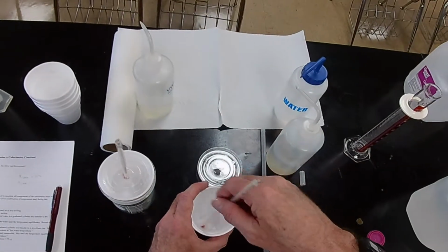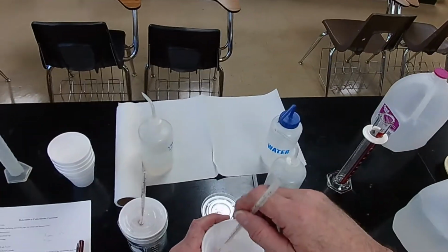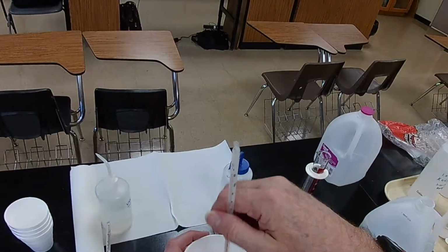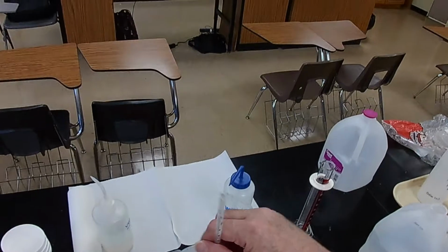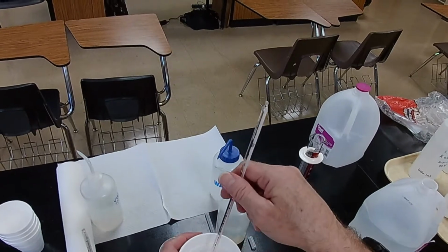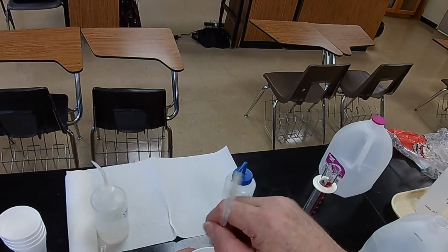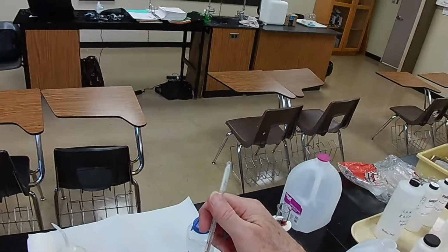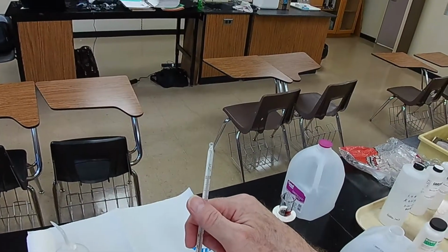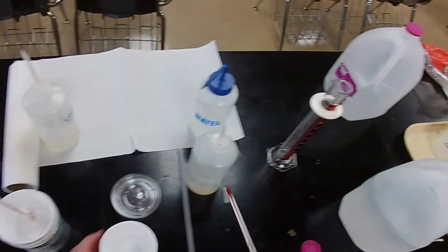All right. Let's stir this around and get a good temperature on it. You know, sticking a thermometer in here absorbs some of the heat. So the temperature of the water goes down, but it will tell us the temperature immediately before we combine them. Okay, still creeping up a little bit. Nope, that's it. 63.5.